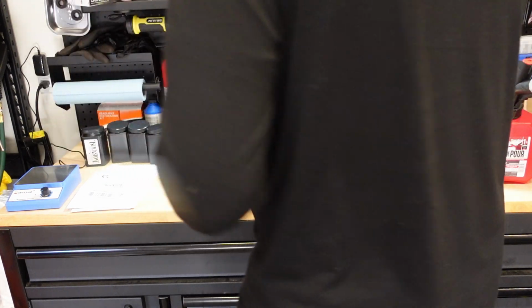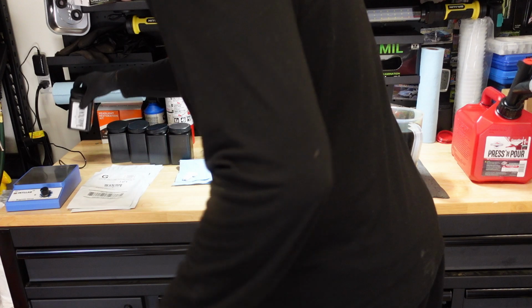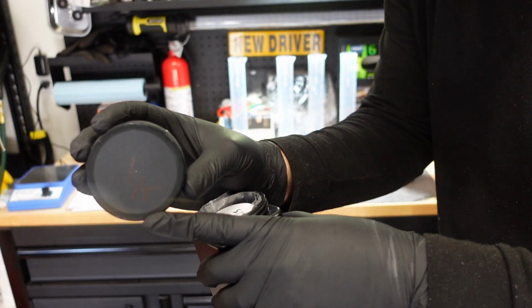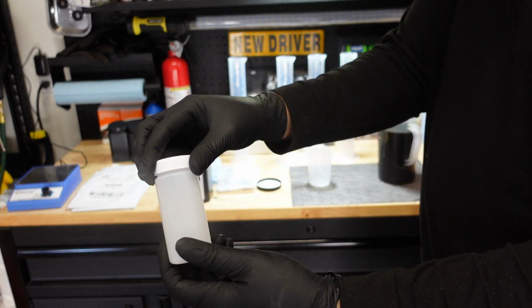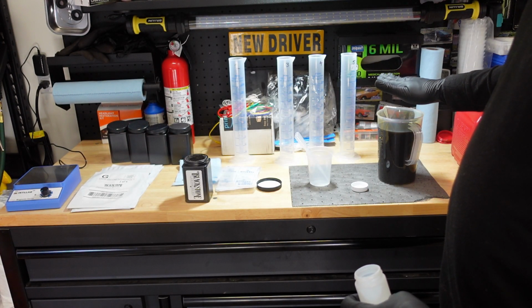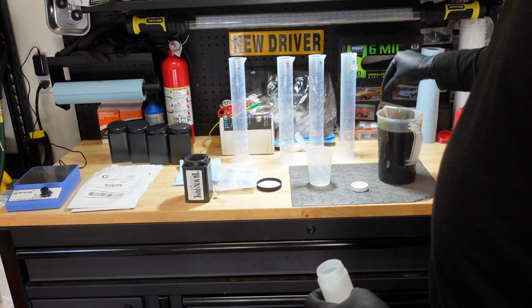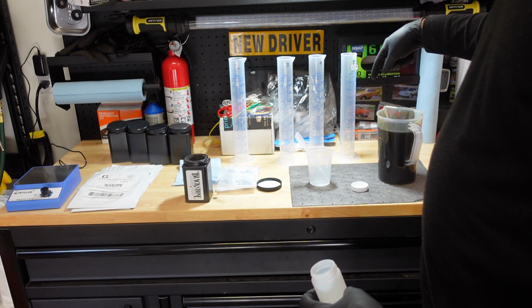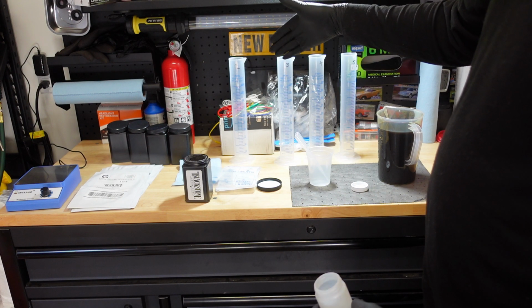All right, so what we're gonna do here is go ahead and fill this first one. Well, actually, let's be a little thorough here and do something first. This right here is sample 1 of 5. We're gonna go ahead and add just our baseline in this one, so that's gonna be just a plain oil. That's not saying that there's no gasoline in here, by the way. I wanna make that clear. It's just saying that we're not adding a known amount. If there's a little bit of gas in here and it detects it, you can subtract this amount of gas from the rest of the samples that you get, and then that will correct for that.